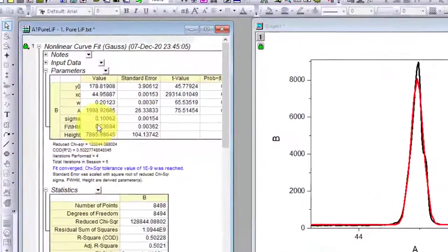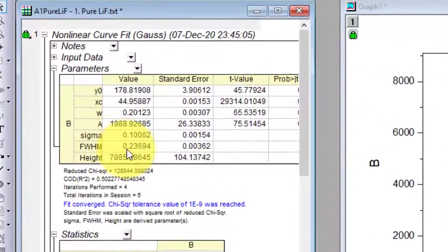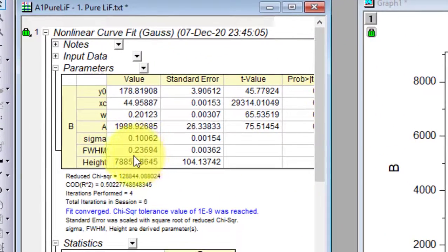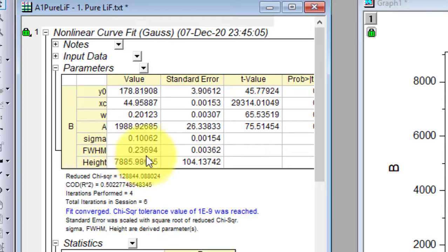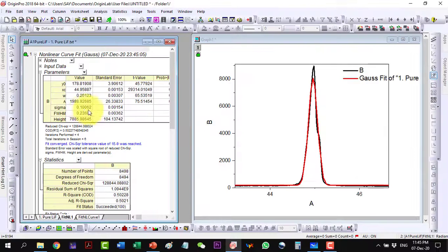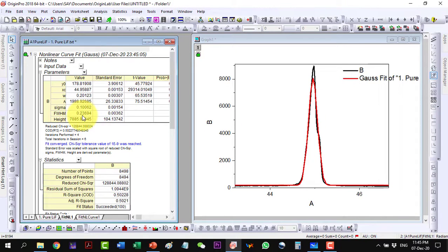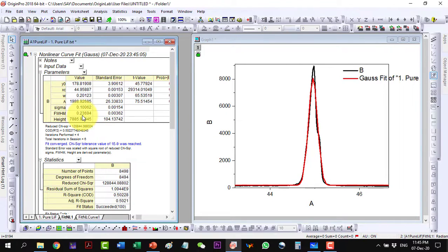I will take the full width at half maximum from here which is 0.23694 but note that this is given in degrees so I will have to convert this into radians before using for calculation of the crystallite size.